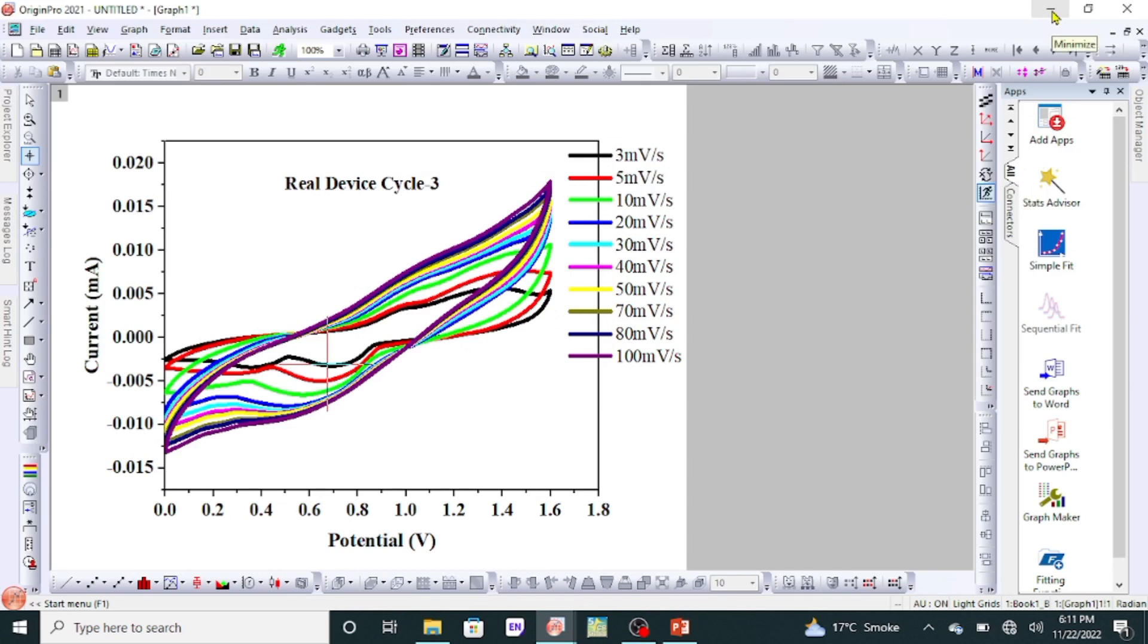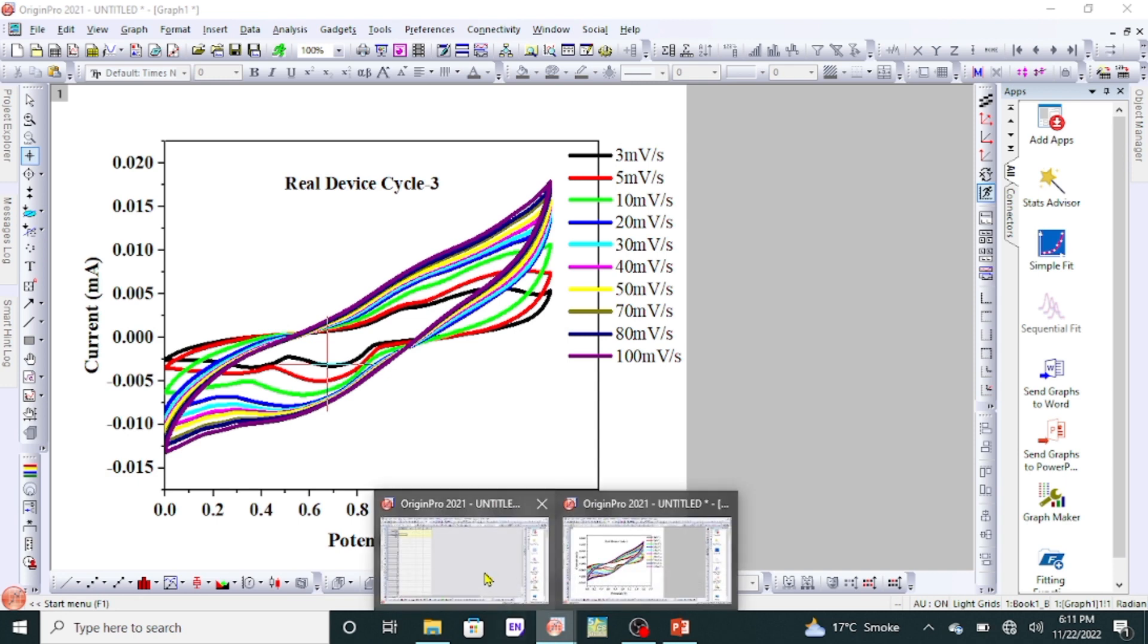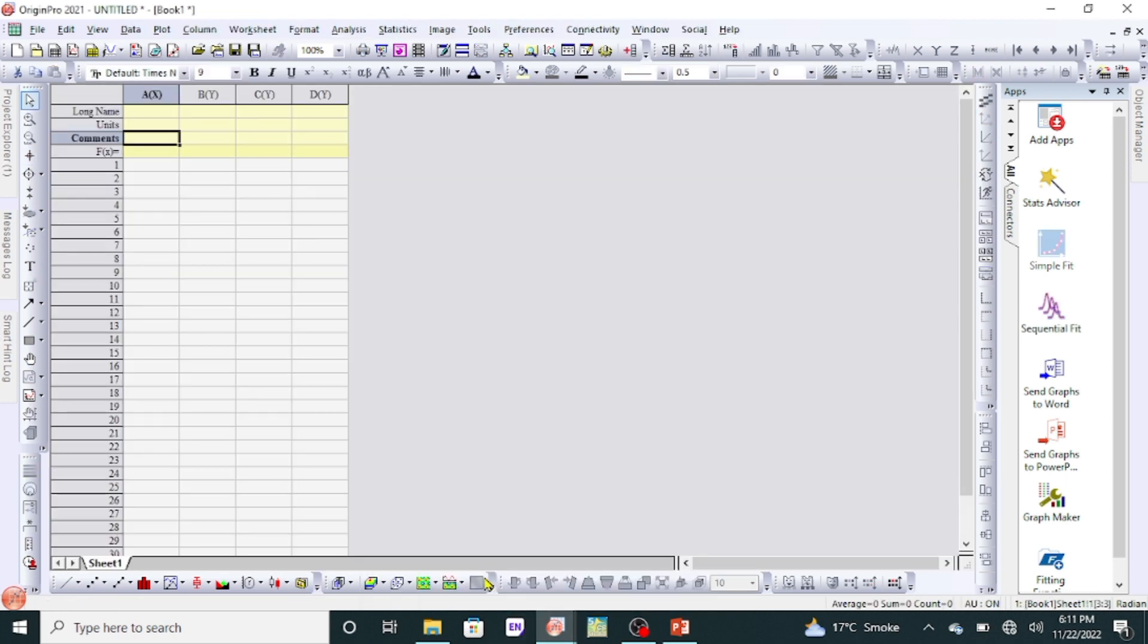Assalamu alaikum. Today we want to learn how to draw a b-value graph from the CV graph of a real device. First of all, we have to open Origin Lab and you will see two columns by default.